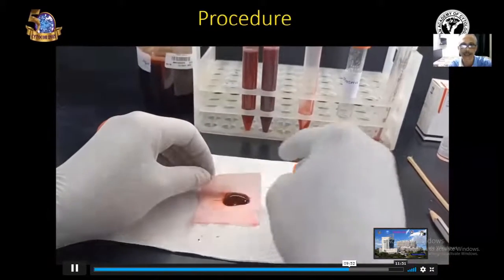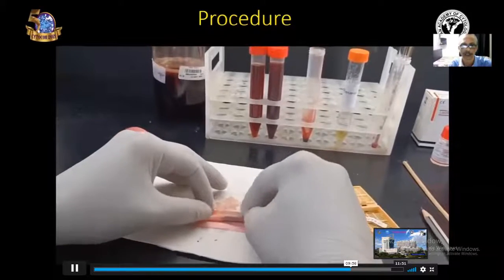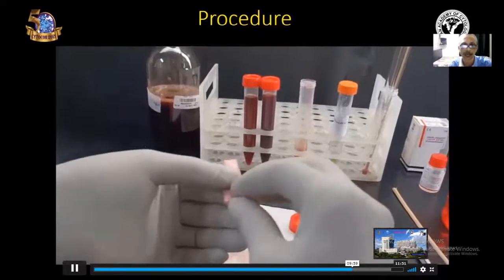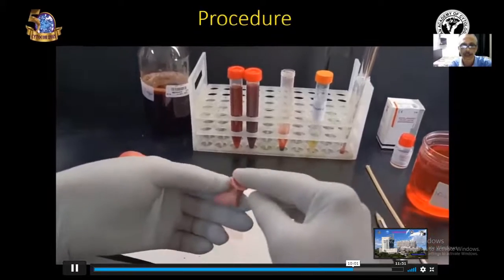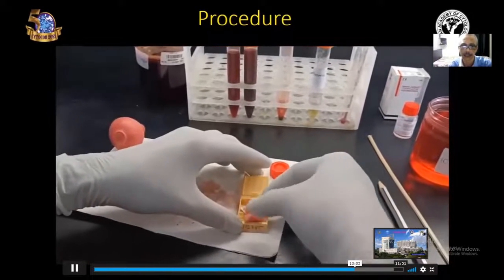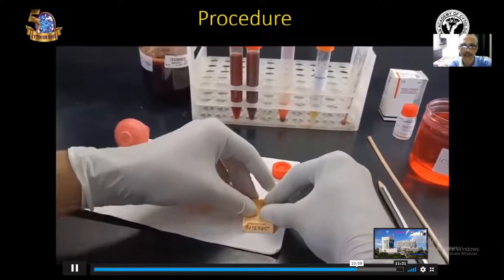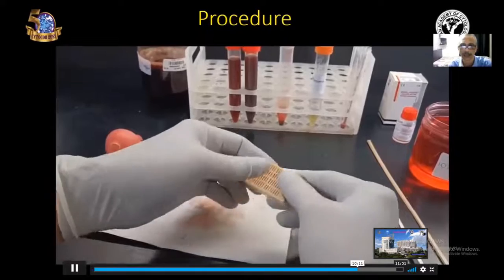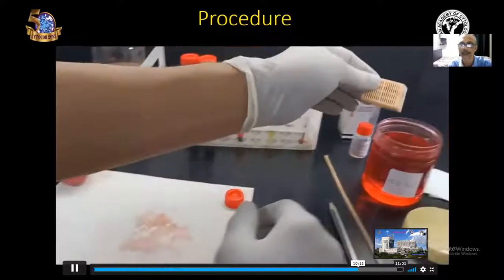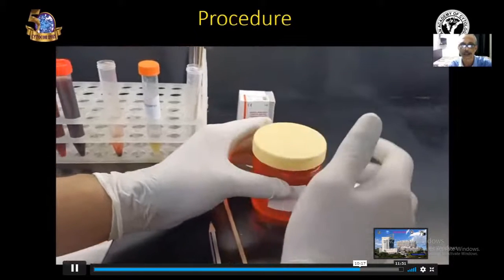The next step is wrapping the sediment with the wet filter paper. Slowly wrap carefully and keep it inside the tissue cassette and lock the tissue cassette securely. Lock it tightly and put inside the neutral buffered formaldehyde fixative.